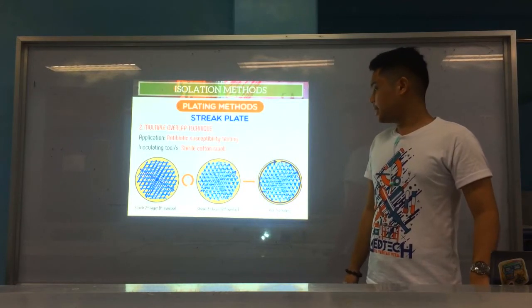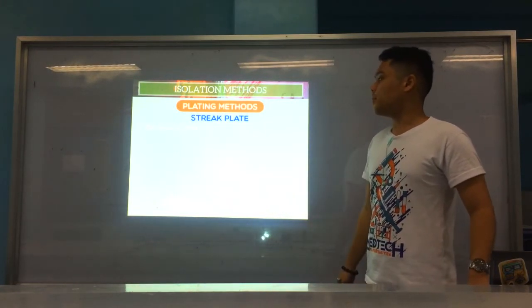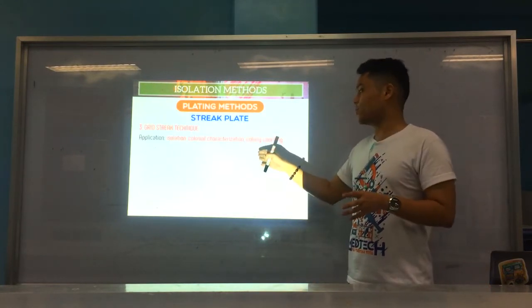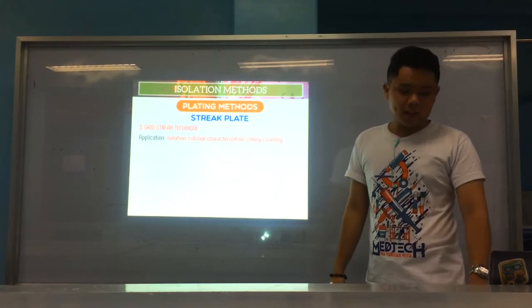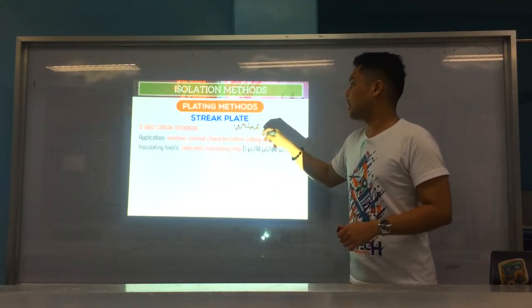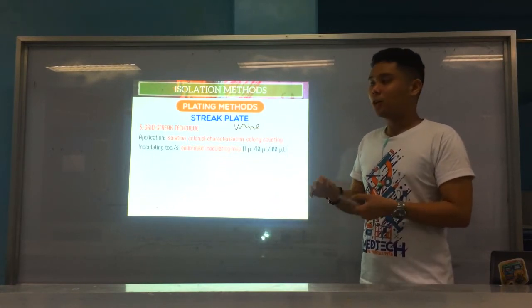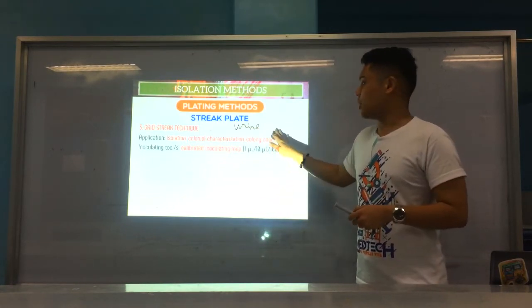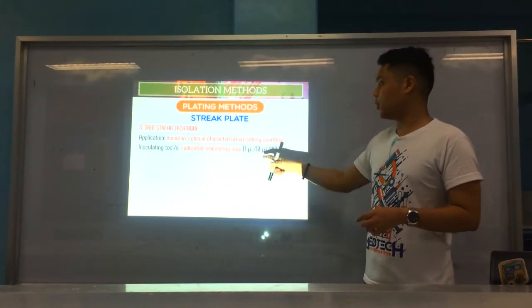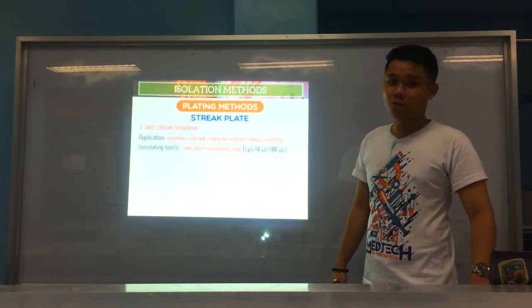Okay. Next is, rim the plate. Rim the sides. Okay? Next, you have grid streak. Now, grid streak is for isolation, colonial, and quantitative, usually colony counting. So it is usually used for urine specimens. Because again, for urine specimens or culture, we want to quantitate. We want to count the number of colonies in your urine. Okay? Alright. So what we use is a calibrated loop, usually 1 UL, 10 UL, or 100 UL. Again, we have a video to describe that.